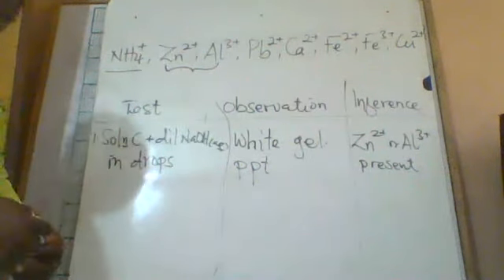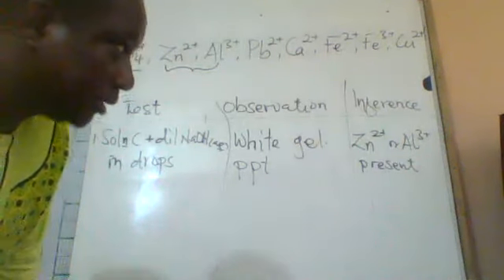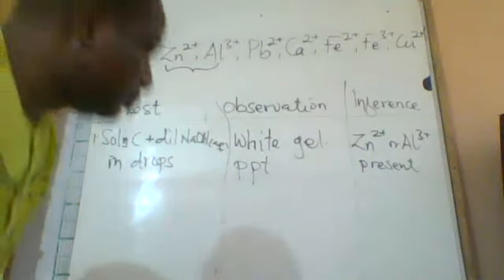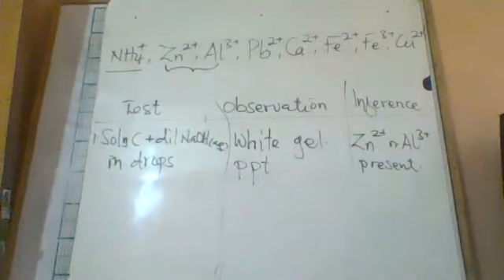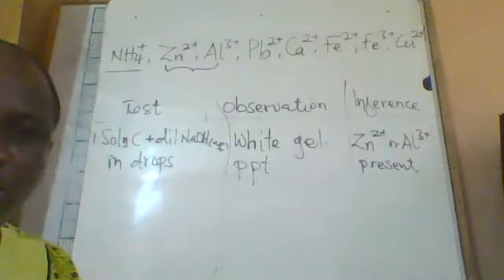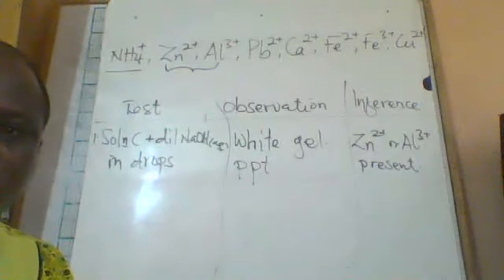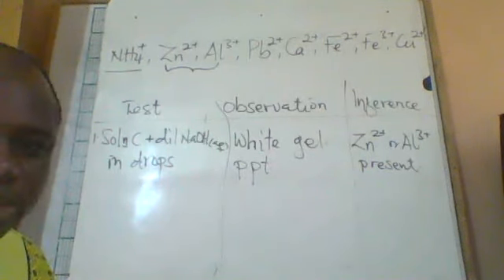I have a question. Go ahead. So does this mean that this is the preliminary test? Yes, it is a preliminary test, because you are using sodium hydroxide.